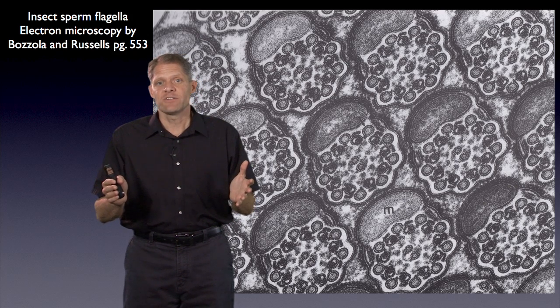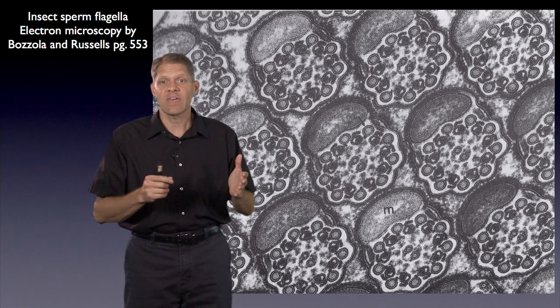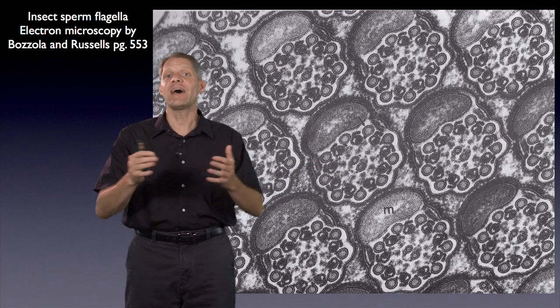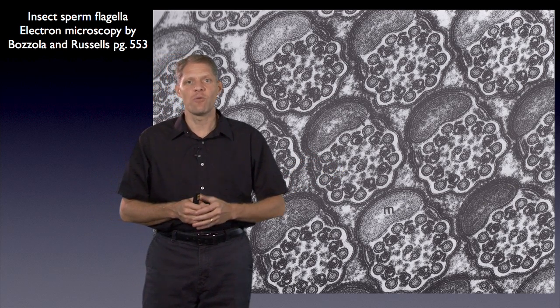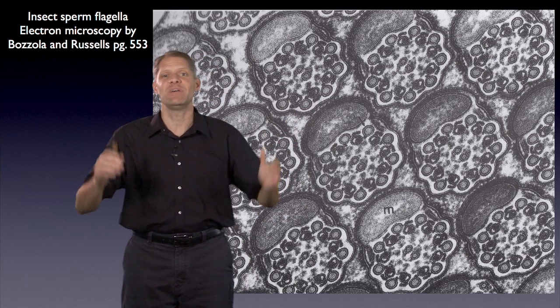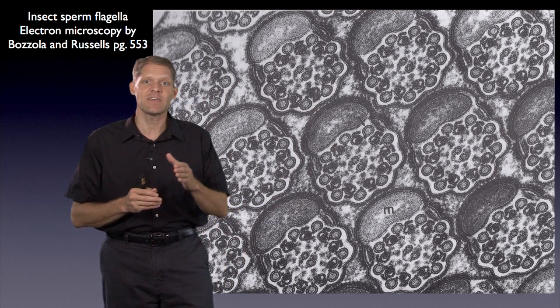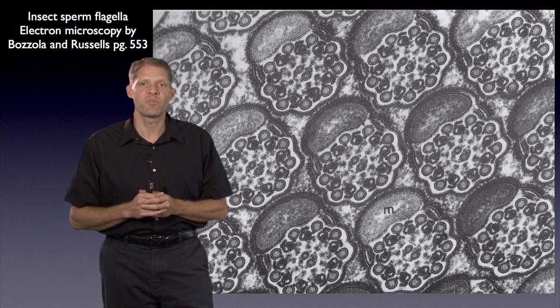Because electron microscopes can go to much higher magnification than is seen here. For instance, what if we tune it to 100,000 times magnification, or maybe 1,000,000, or even 5 million times magnification? Then could we see the alpha helices in the alpha-tubulin protein?